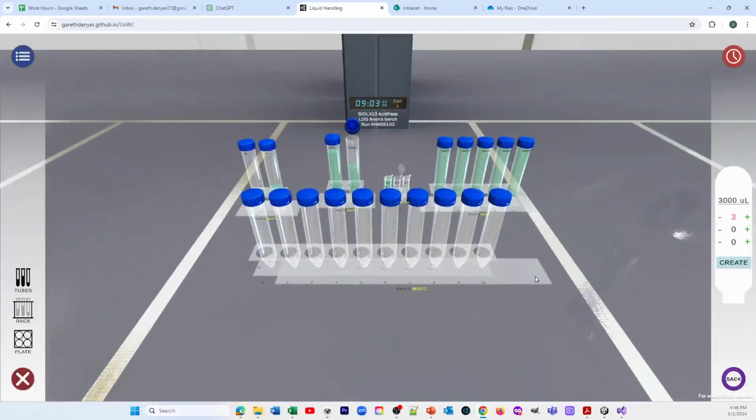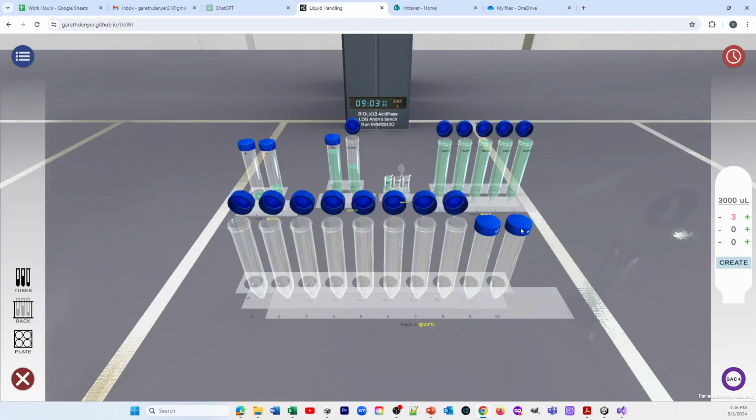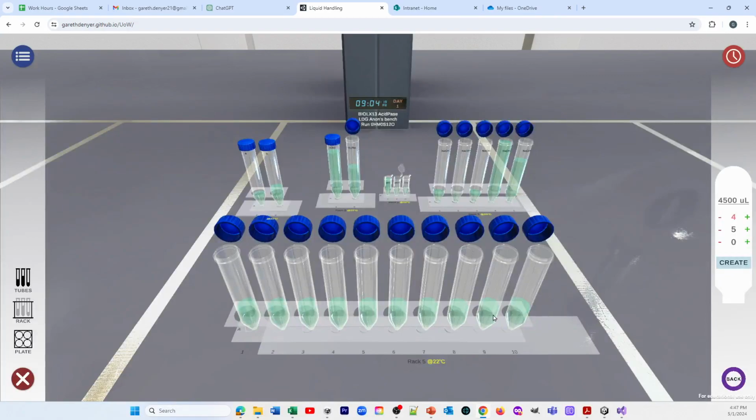And that means that we really do need to zoom out. And we're going to put 4.5 mils of sodium hydroxide in each of the tubes. Now, this sodium hydroxide is going to stop the reaction and it's also going to develop any color. Now, each of the big tubes at the back will only hold 15 mils. So each of the tubes at the back will only do 3 dispensings of the ones at the front. Just keep your eye on that when you're doing this. In the real lab, of course, you will have a dispenser. So you'll just go over to the dispenser and squeeze on the dispenser and it will do everything that we're doing now. So we've got our tubes set up. Each of them has got 4.5 mils.